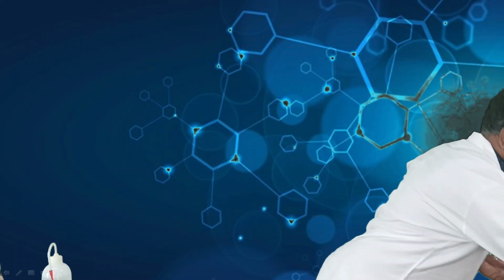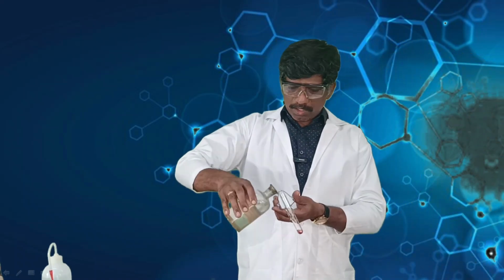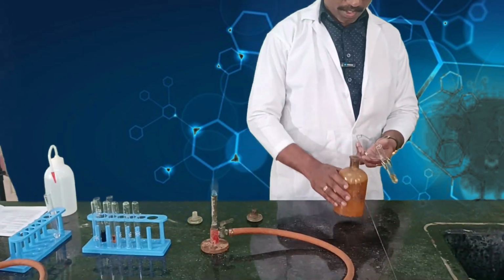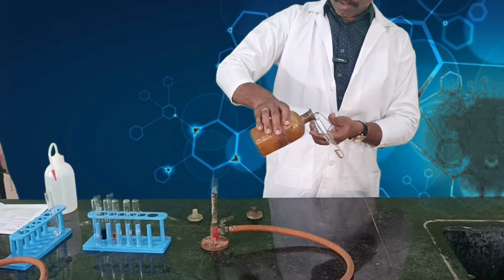Now we shall see the test for phenol. In order to test phenol, we have to take a little amount of the substance and then dissolve it in alcohol, and add freshly prepared neutral ferric chloride into this.